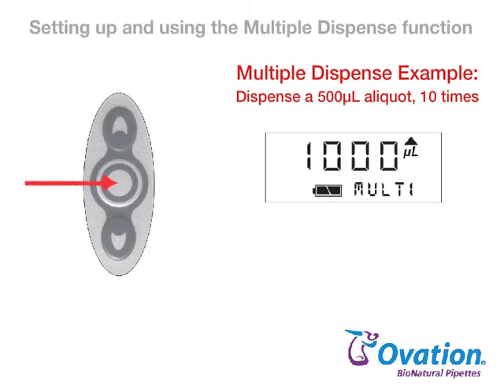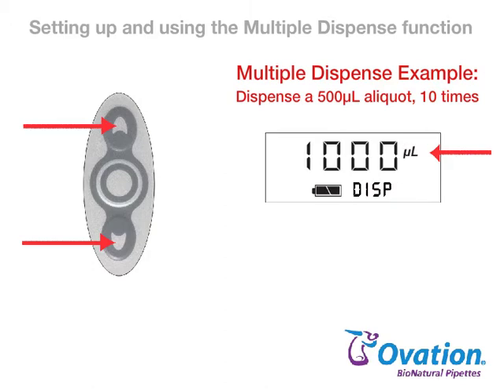Press and release the center button until Multi appears on the display, then press the up or down arrow and the current volume setting for individual dispenses is shown. Press the up or down arrow again to change the volume to the desired setting.